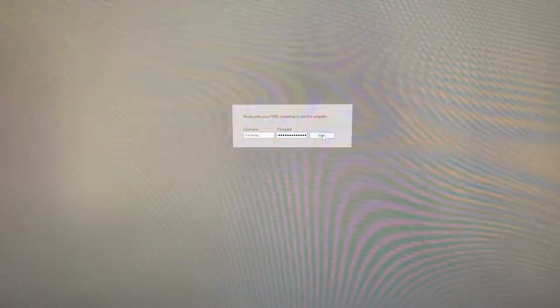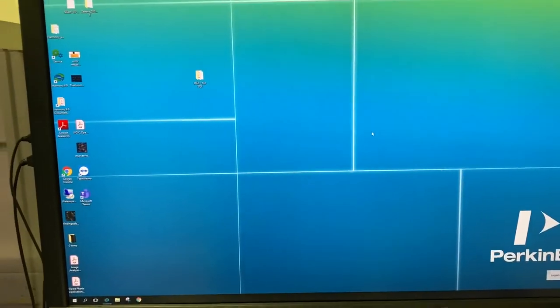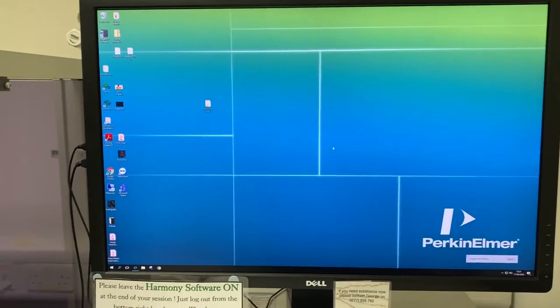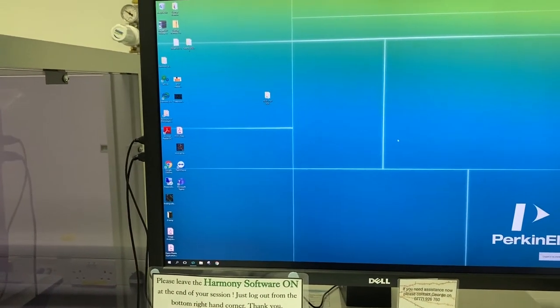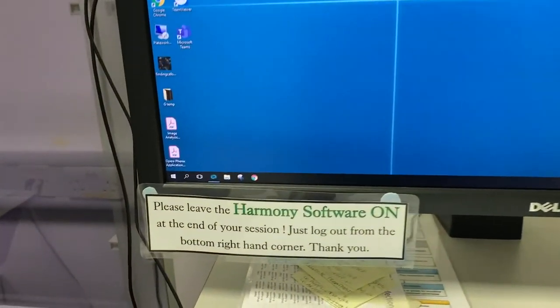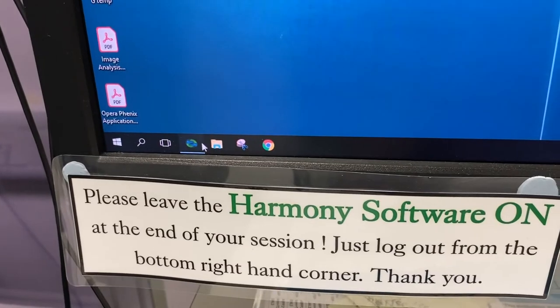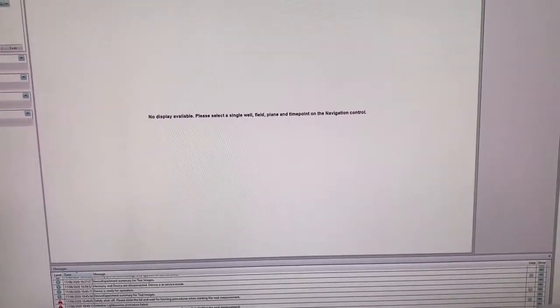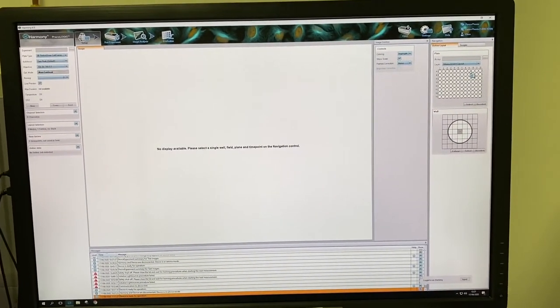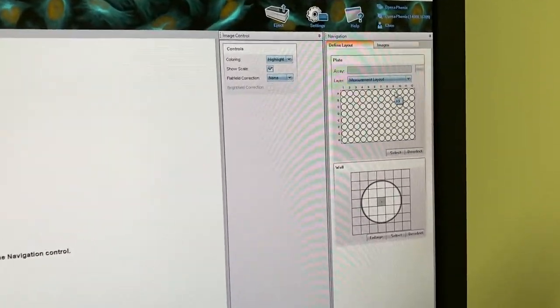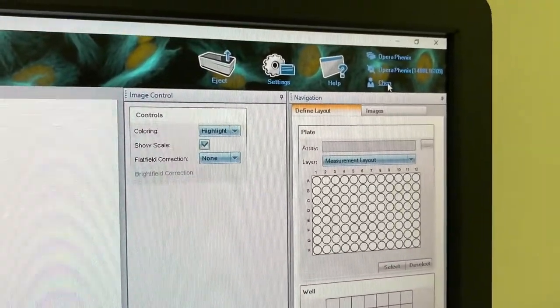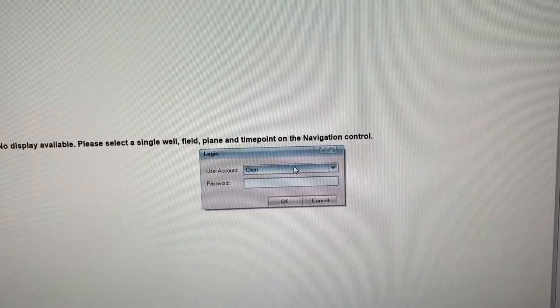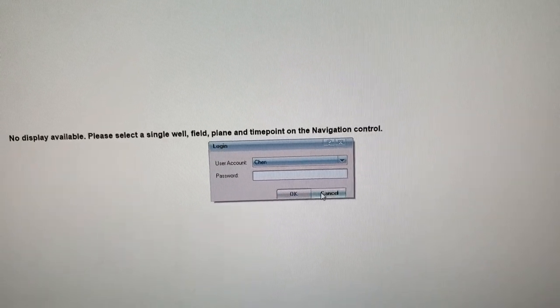Once you're in the computer, the Harmony software again should have been left on by the last user, but if you do need to switch the Harmony software on, then please click on this icon. Once you're inside the Harmony software, you want to go into your own user settings, so click on this and login. I'm already logged in.